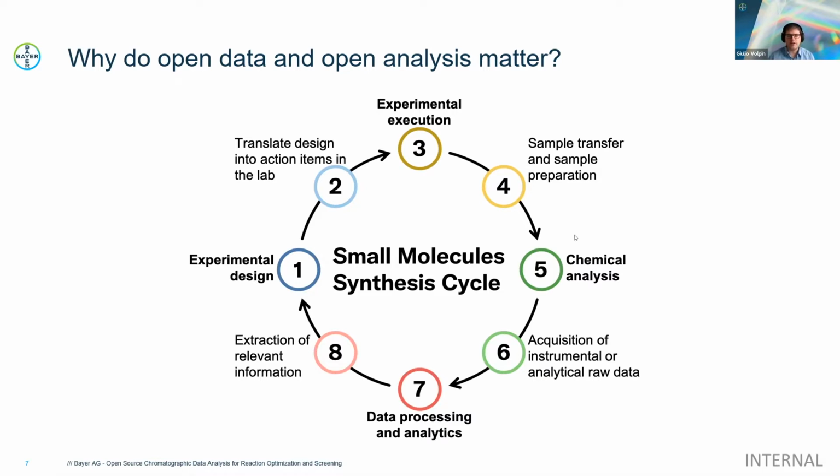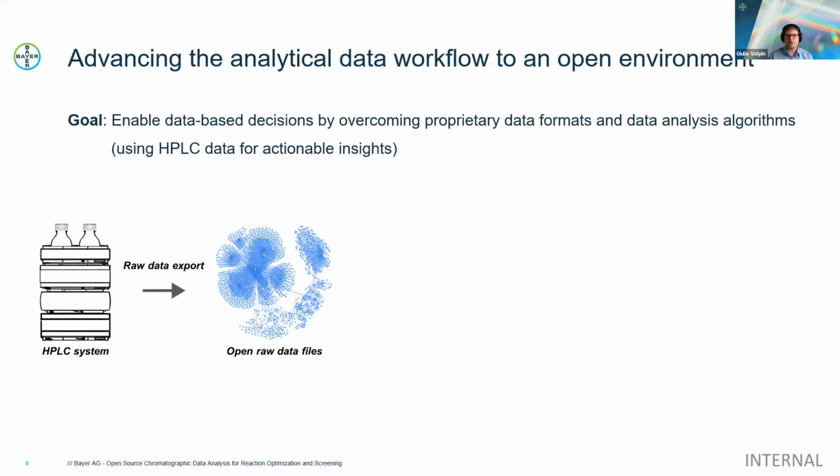And usually our data is processed until now in software that is shipped with the analytical instrument. If you use ChemStation, Lab Solutions, or Empower, you are quite dependent on the type of instrumentation that you have and the type of possibilities that you have downstream, being processing methods, the way the data is stored, the way it is transported to be visualized with other tools, and we saw a great opportunity to improve on this matter. And so this is what we focused on in our team.